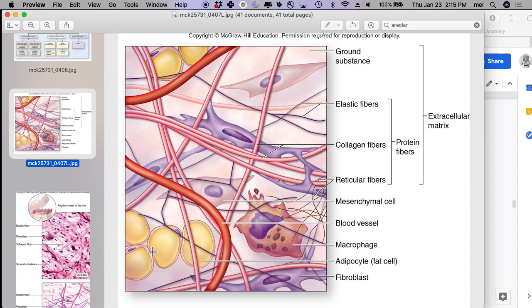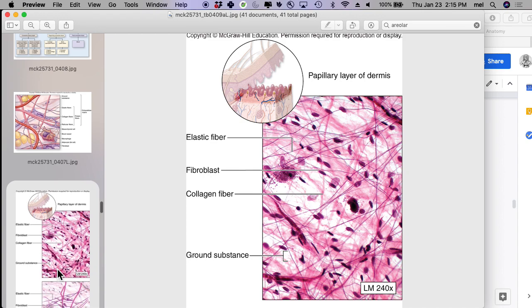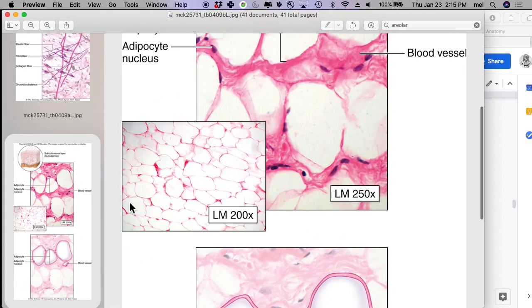And so in this subcutaneous layer, we all know that you can have more or less adipose that moves into it, adipocytes that move into it. So what happens is this, although it's not staining on this figure, this has a few adipocytes in it, especially if it's subcutaneous right here in the subcutaneous layer, right? Okay, so what happens is it can end up looking like this one right here, which doesn't look at all alike. So let me show you how that actually occurs.